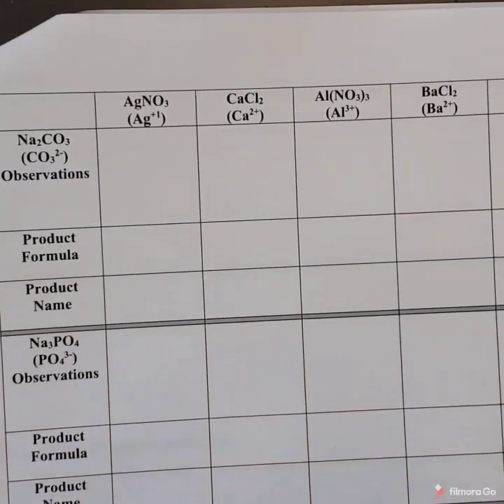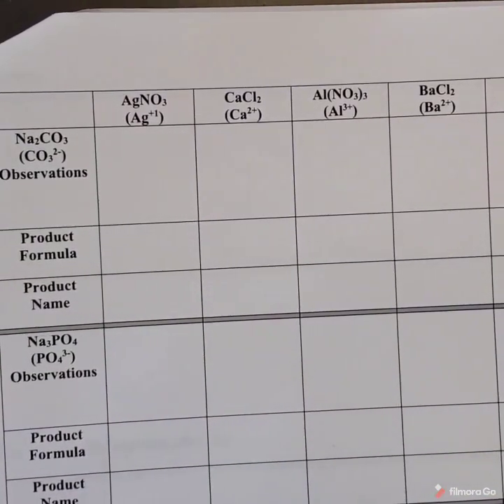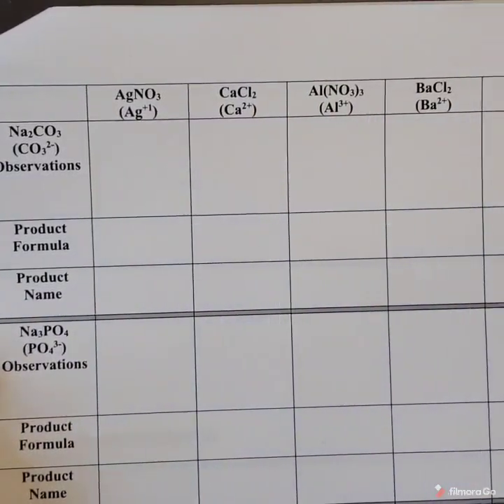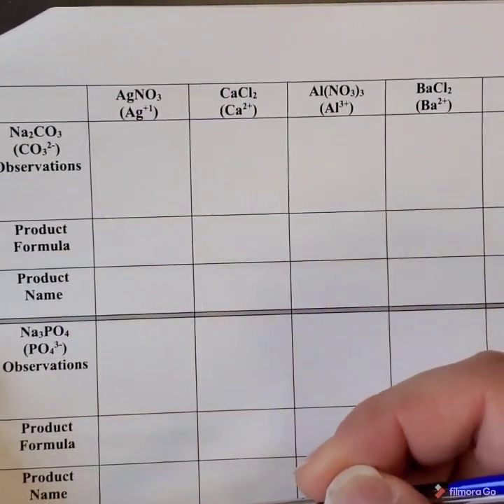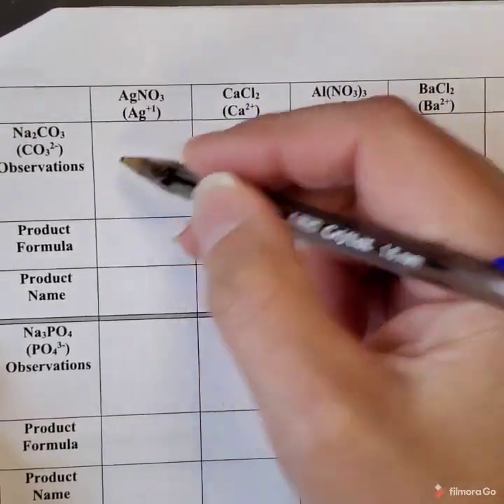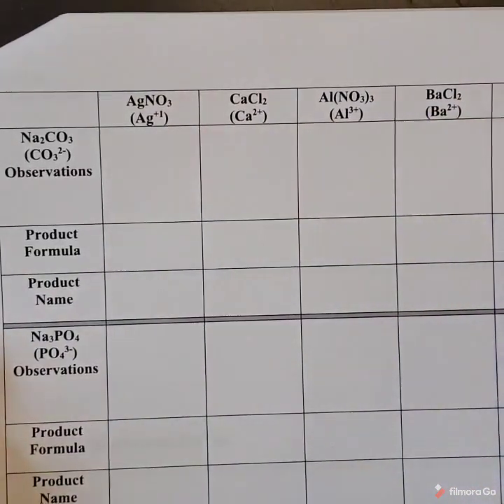All right, and then for the final thing, we need to talk about how you're going to fill out the chart. These are the chemicals that were along the top, these are the chemicals that were along the side. This is where the reaction occurred. These would be like my little beakers, the bigger squares.